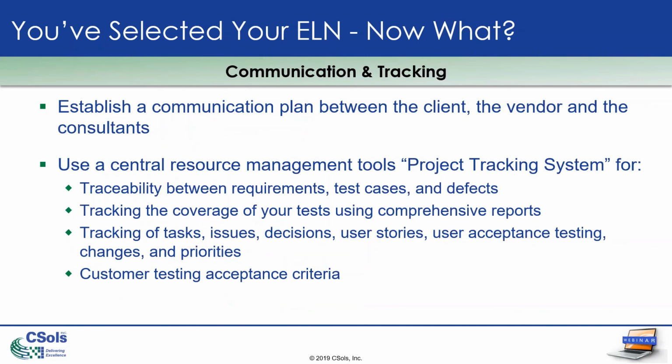For communication and tracking, you need to be aware that because you are implementing an ELN system, many changes can happen during this implementation. So at least you need to have a valid communication and tracking system plan in place that is shared and communicated to all stakeholders.